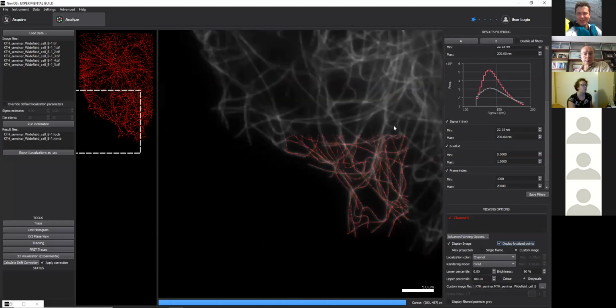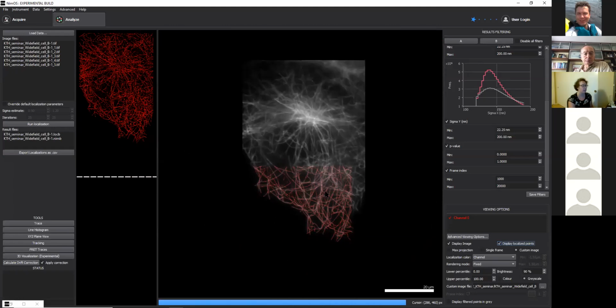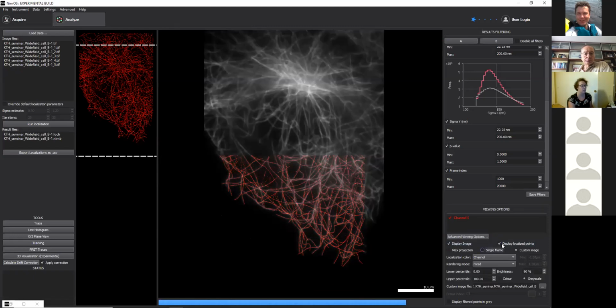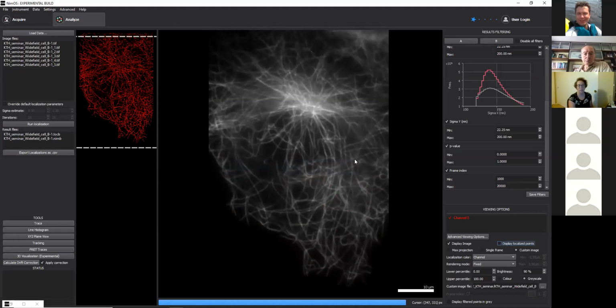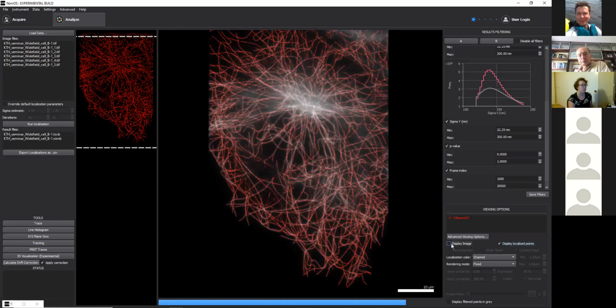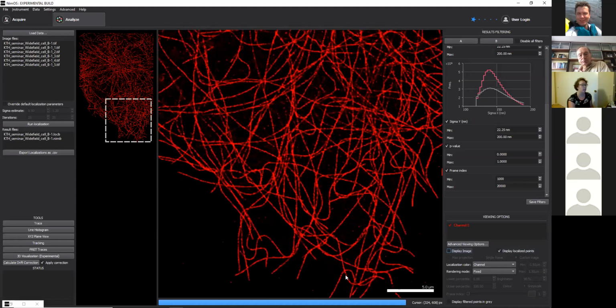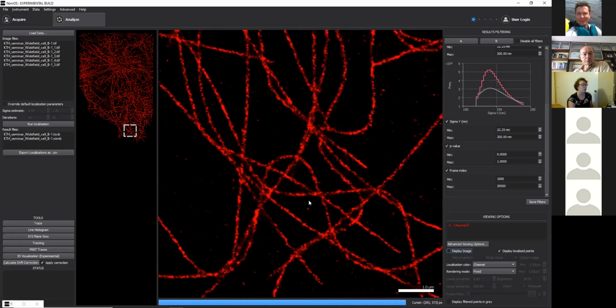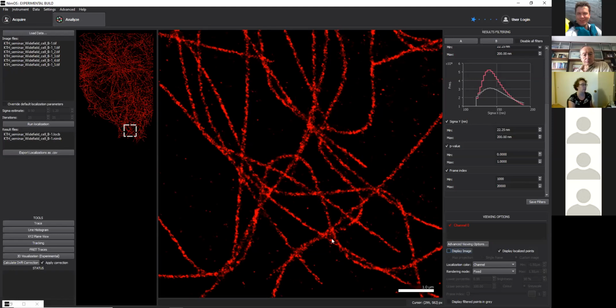While the wide field, if I just zoom out for a second, you can see the wide field image actually looks pretty good when you zoom out. You can see individual microtubules, you can see their nice pattern and structure, but really the D-Storm imaging comes in when we're trying to look at those individual interactions between target proteins or between organelles, or even just looking at the quality of this cytoskeletal network.